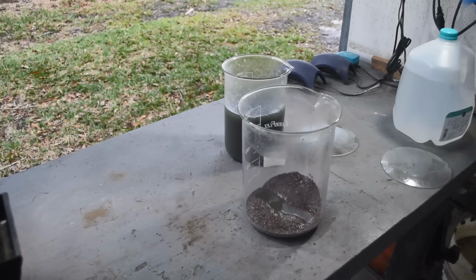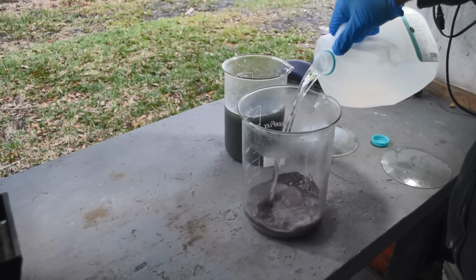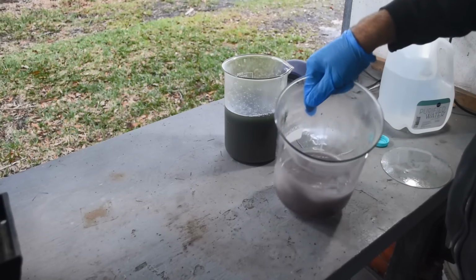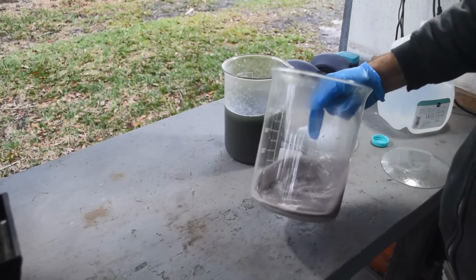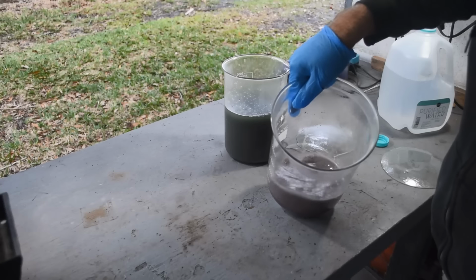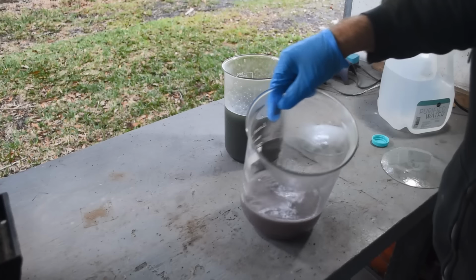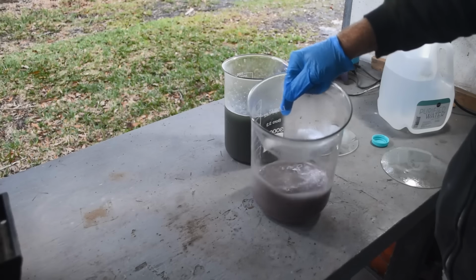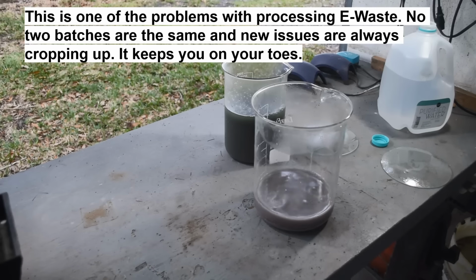I'm going to give it one more boil, but before I do, I'm going to rinse this stuff with some distilled water and see if I can dissolve whatever those crystals are and get them out of here so we don't carry it forward, whatever it is. I might have to put this on the heat to get those to dissolve because I can still see them in there. Even though the water's all turbid now, I can still see the crystals. They don't seem to be dissolving. So I'll put this on the heat, warm it up, and see if they dissolve. Hopefully they will, whatever they are.